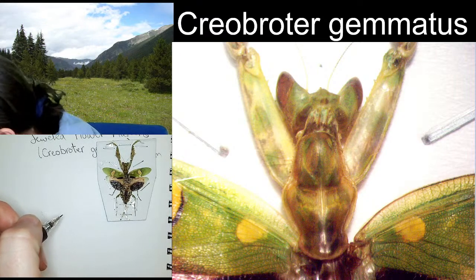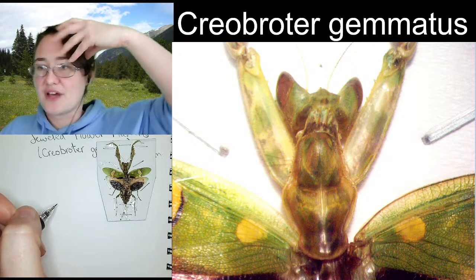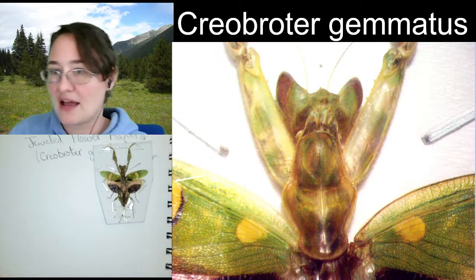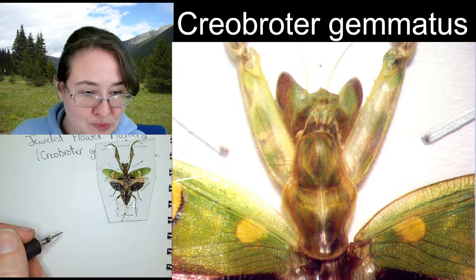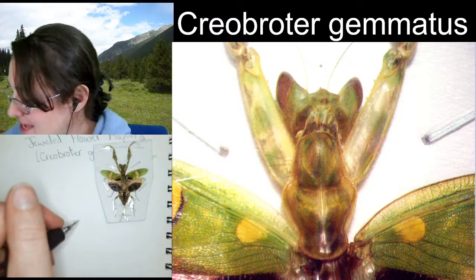All right. So this mantis, this flower mantis, has very kind of elongated and pointed compound eyes. You can kind of see that in the microscope here. Welcome, Deb. Good. We're glad that you're here.